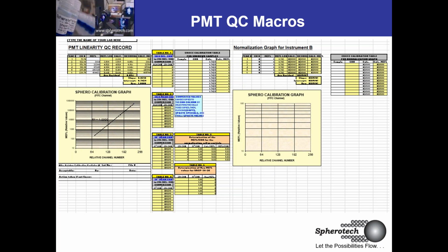But if you know the concentration of your reactant, the amount of which bound, you can say something significant then about any ratio that you make between it and a secondary population. The juveniles have 1/3 the amount of expression on average, significantly over, let's say, 10,000 events, right? That's exactly what we're looking to do here.